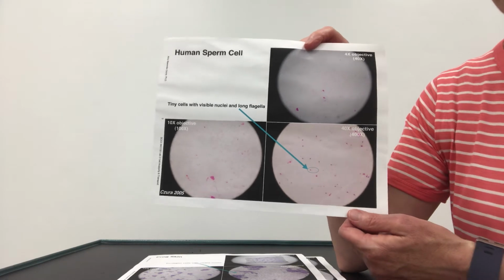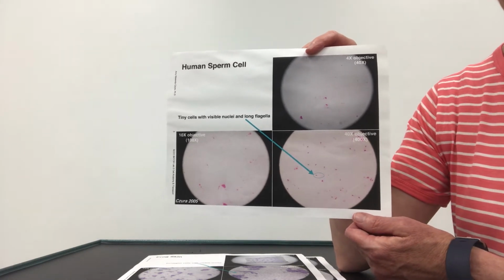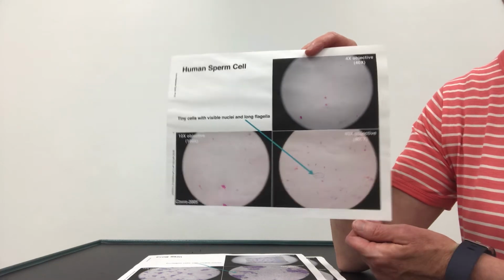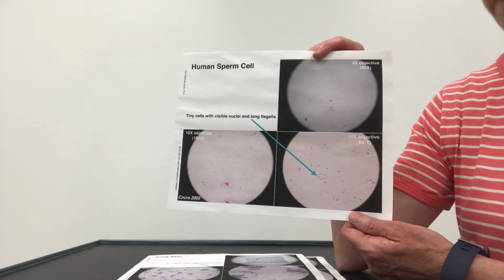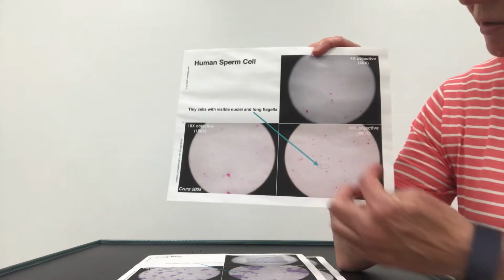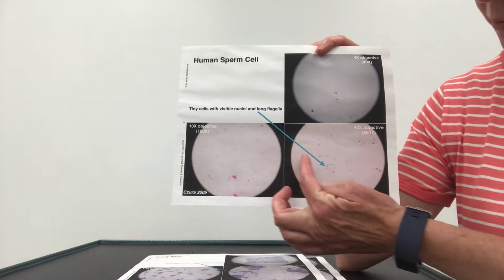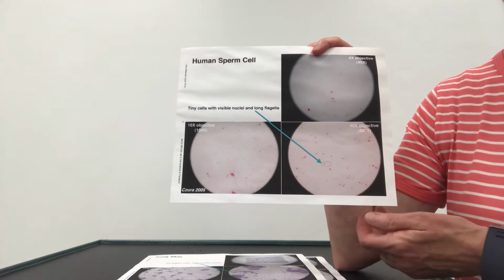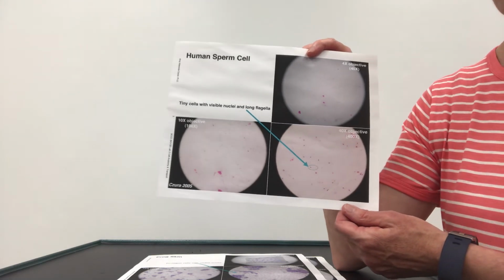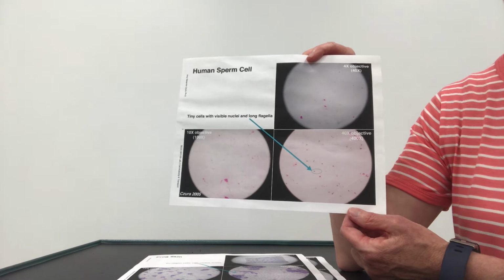Now when you're looking at these, you should also be trying to estimate the size of these again. On the handout that we provide, it gives you the diameter of the different magnifications, and you would again estimate how many you thought would line up across here, maybe head to tail across. If I said there was 10, I'd divide the diameter by the number 10, and then I would have the actual estimated size.